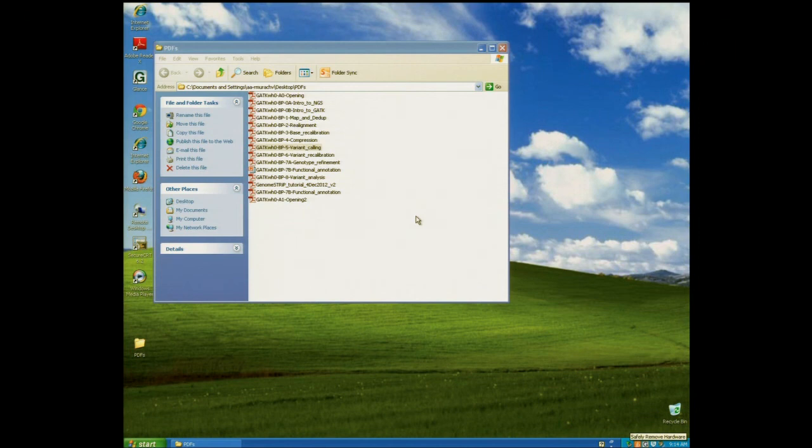If people went to the tutorial and the hands-on session yesterday, at the end, we could see through IGV the BAM, we could visualize it, and we could see the reads in some places that had very clear indications of where a SNP was or where an indel was.